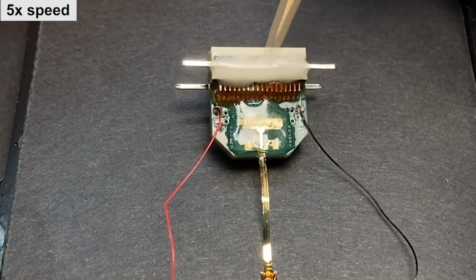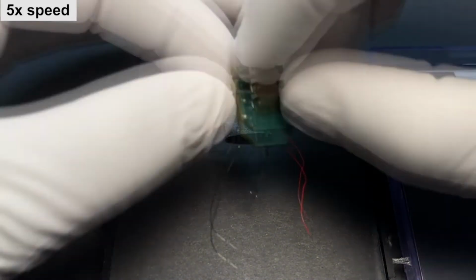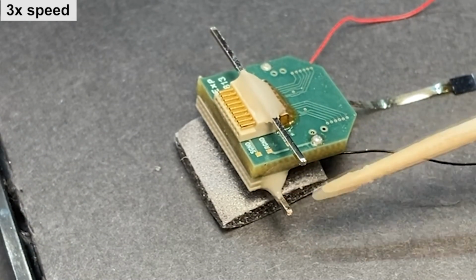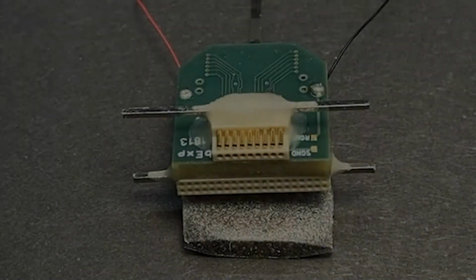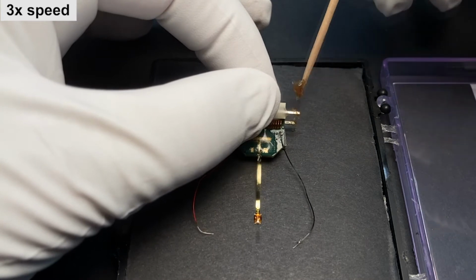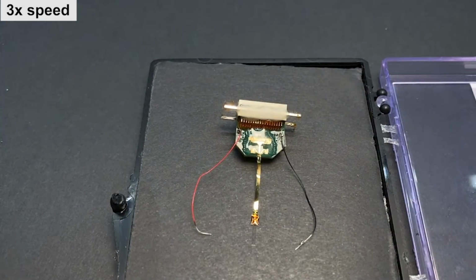as well. And then once the cement is applied on the flat surfaces, I always put some cement on the side just to create a better connection between the PCB and the metal bar. And then I do this for all four corners where the metal bars are attached to the PCB. And as one of the last steps, you can apply some flux and then solder to the metal bars.